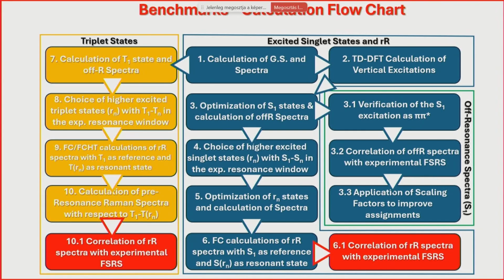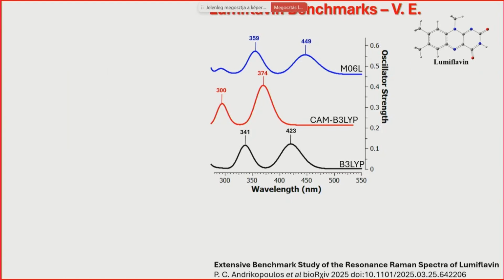Of course, you can tune your Raman pump to be closer, and therefore more in resonance, or not, experimentally. But for the given setup, the triplet can be thought of as being in pre-resonance rather than resonance.